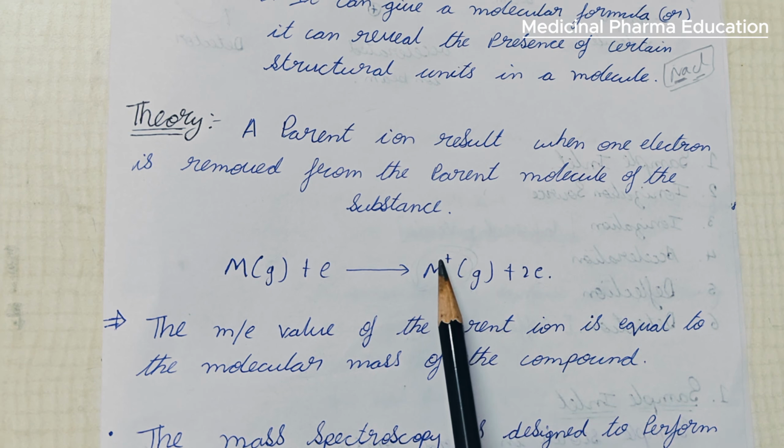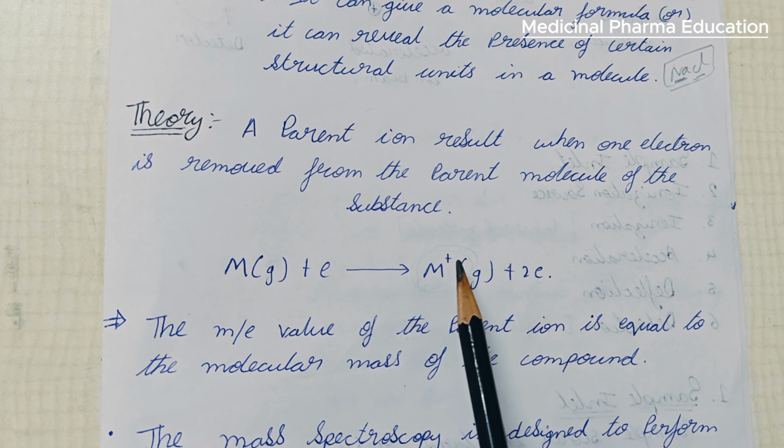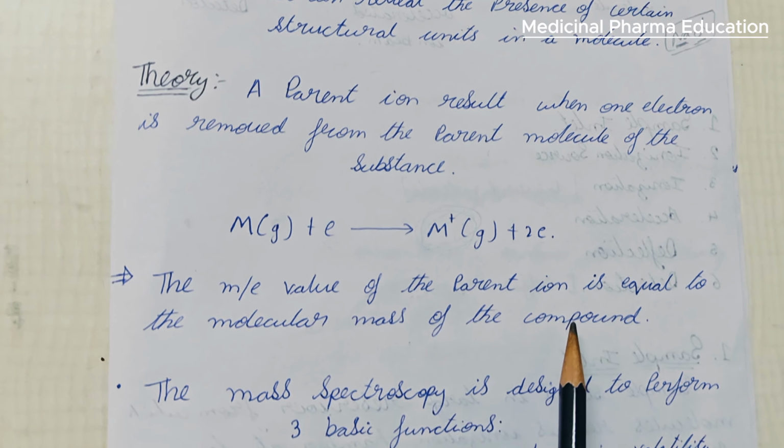This is what we need for analyzing the sample. Because here the sample is interactive, it can absorb the energy, or it can absorb the electrons.